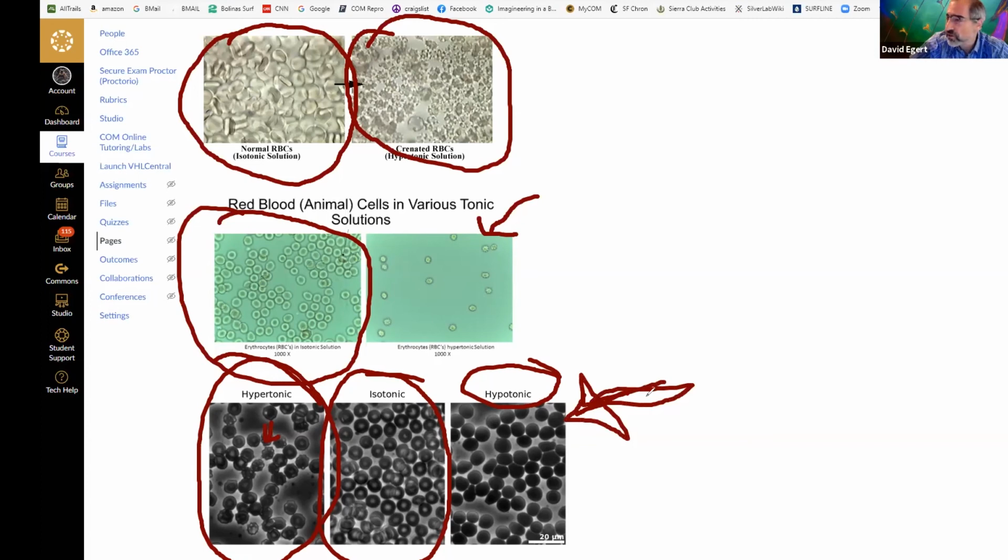Could this be test tube 1, the distilled water? No, the difference in osmolarities was not that much. Exactly. So what is the only one of our tubes that this is possibly? Number 7.